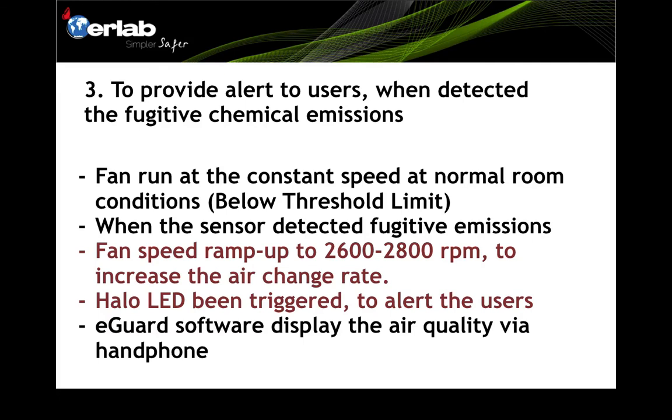Number three — to provide alerts to users when fugitive chemical emissions are detected. Under normal room conditions where air quality is below the threshold limit, the fan runs constantly at one speed. The sensors continuously monitor room air quality. When the sensor detects fugitive emissions exceeding the threshold, the fan speed ramps up to 2,600–2,800 RPM to increase the air change rate and remove fugitive emissions as quickly as possible.